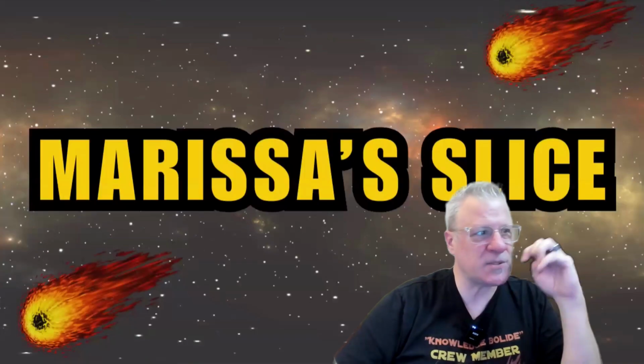Fantastic. Putting the group in group classification. This is Marissa's metal bleb. So yeah, Marissa has the biggest metal bleb in her piece. So I will measure that so you can submit that, Daniel, in the background while you guys are talking.